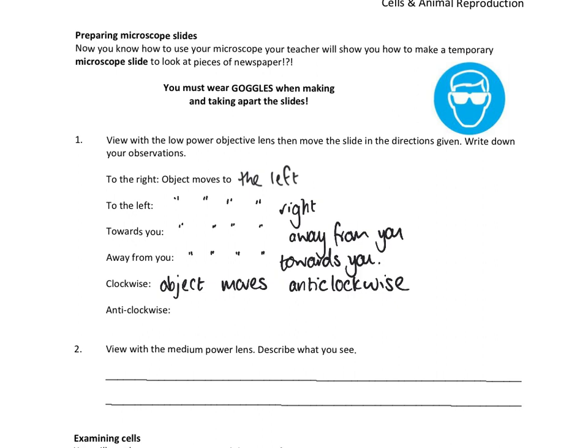And likewise, if we move the slide in an anti-clockwise direction, what do you think happens to the object or the image that we see? The object, of course, moves clockwise in the opposite direction. So when you're moving about a slide, it takes a little bit of fiddling around with it to get your image in view. It's playing around with it and manipulating it that you see, okay, actually, if I move it to the left, the image is going to appear moving towards the right. And hopefully someday soon you'll get a wee bit of practice in using microscopes and seeing that for yourself.